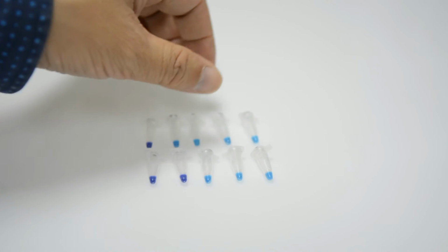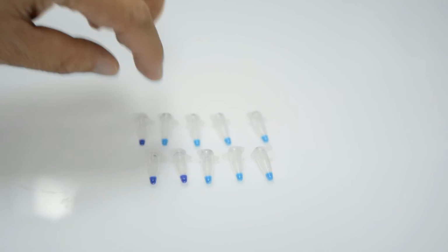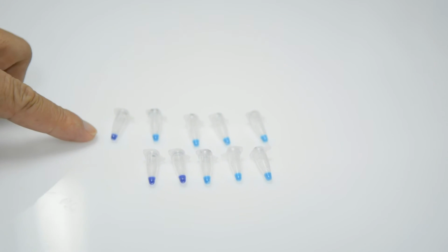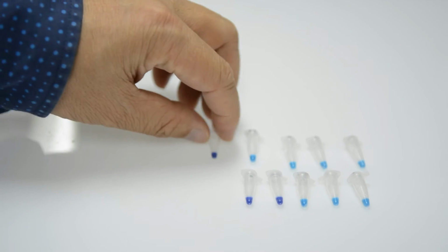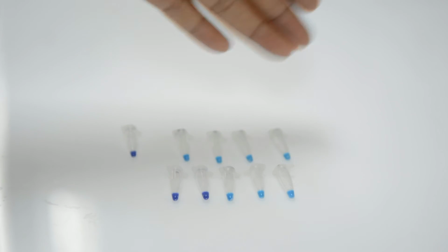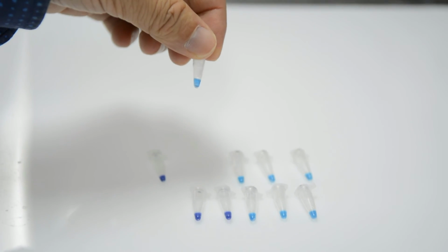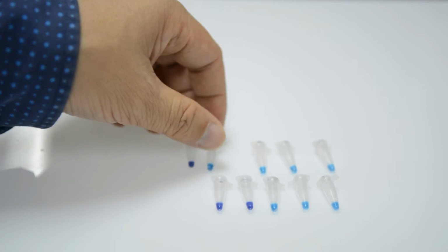As you can see here, blue is a sign of a positive reaction, while the negative looks somewhat purple. This is a negative water control, and this is an example of a cassava sample, and this reaction means that the DNA quality is very good, so it supports amplification.